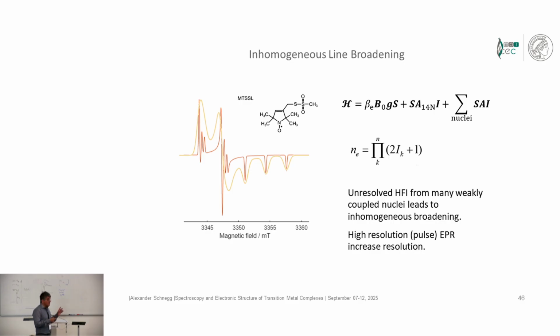This is the multiplicative broadening of the spectrum by coupling to many magnetic nuclei in the vicinity, and in most cases this is just hydrogen. Hydrogen is everywhere, has a pretty large gyromagnetic ratio, gives good splittings, and this broadens the spectra a lot.